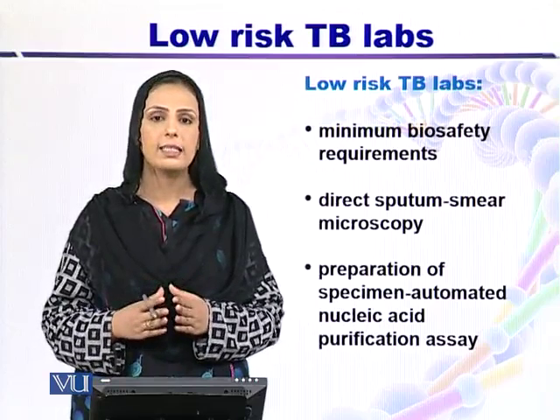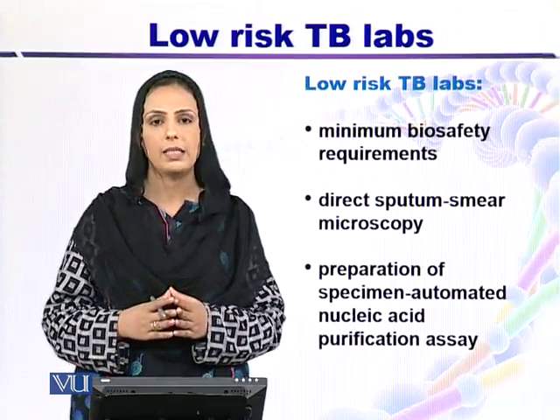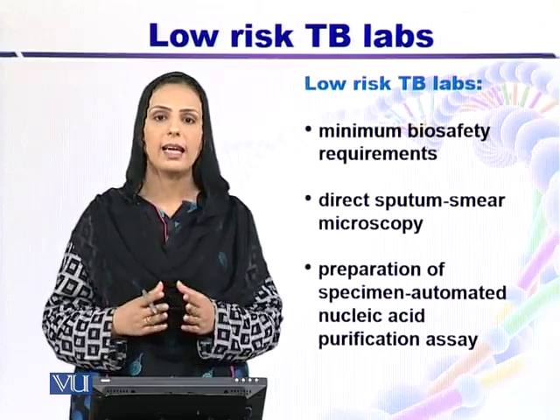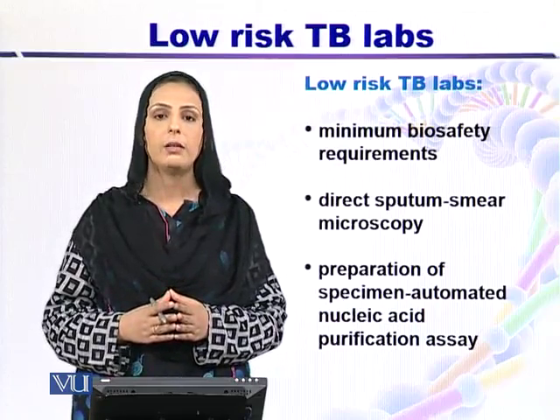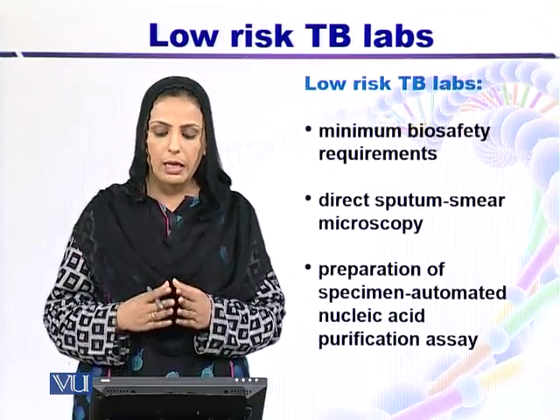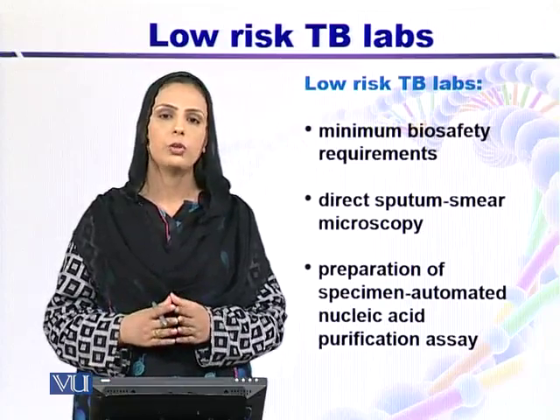And the second step of the staining is fixation. In fixation, we maintain the morphology of the bacteria, but the fixation process kills the bacteria. So after fixation, the slide is safe to handle. But while we are preparing the smear, we have to be a little bit careful because there are chances of minimum aerosol generation.